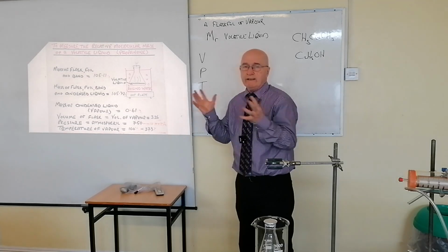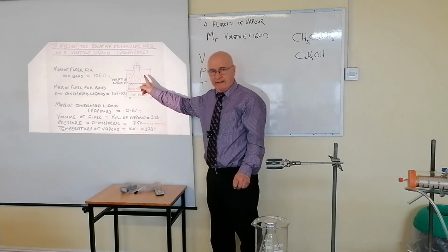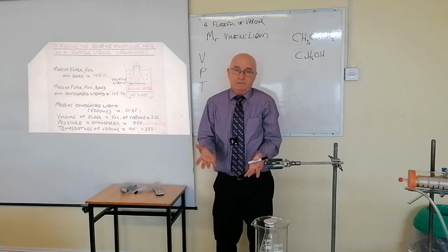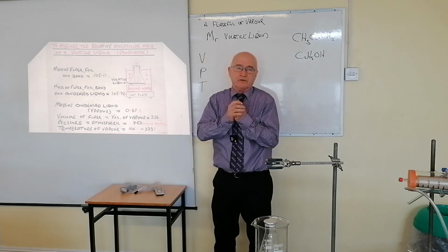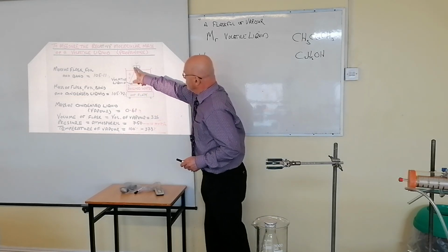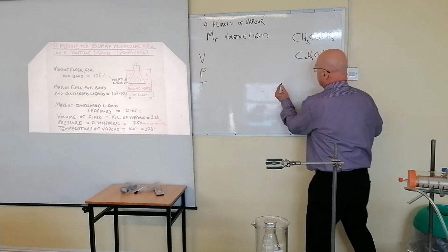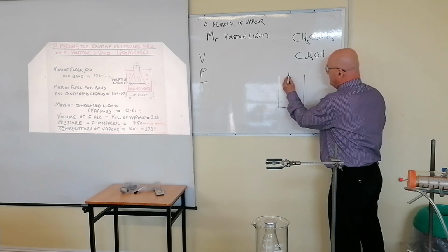You need to show clearly that the apparatus works. That flask would not sit like that inside the boiling water. It would float, it would be buoyed up. So much of the vapor would not be at 100 degrees. It's essential that you have most of the flask under the water. Now I'm going to draw this again deliberately to give you some ideas of what's happening, right? You draw that and your flask would be in here.